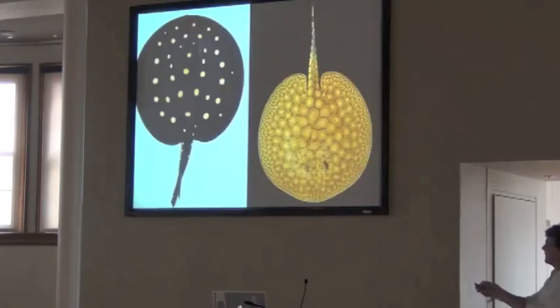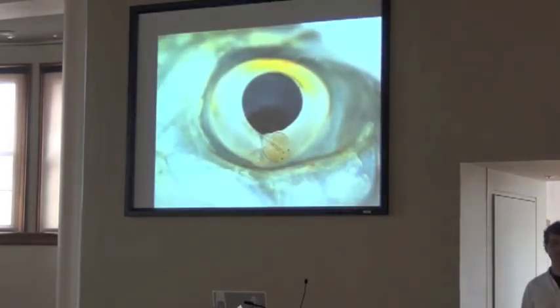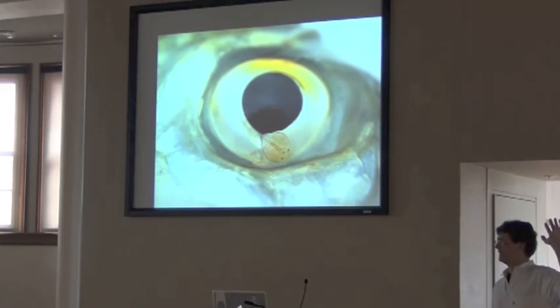When you're photographing these fishes, be mindful not just of the lateral view — there might be special features you really want to capture while it's still alive. In this case, the teeth are diagnostic of this species. If you don't prop the mouth open, it'll seal shut and you'll never be able to see those teeth again unless you dissect them out. Also look at your specimens — they might have some cool stuff on them. That's a little parasitic crustacean, I think it's dolops. Be mindful of other interesting aspects of your specimen that you might capture at the same time.